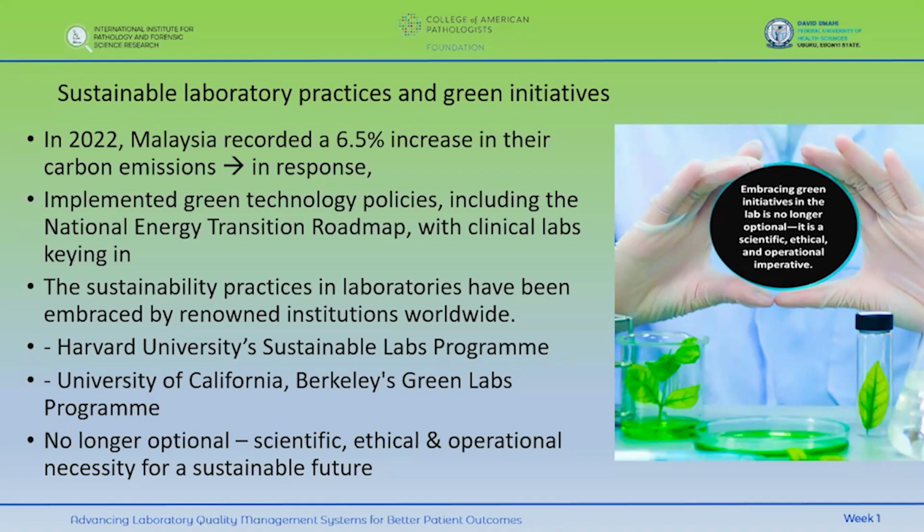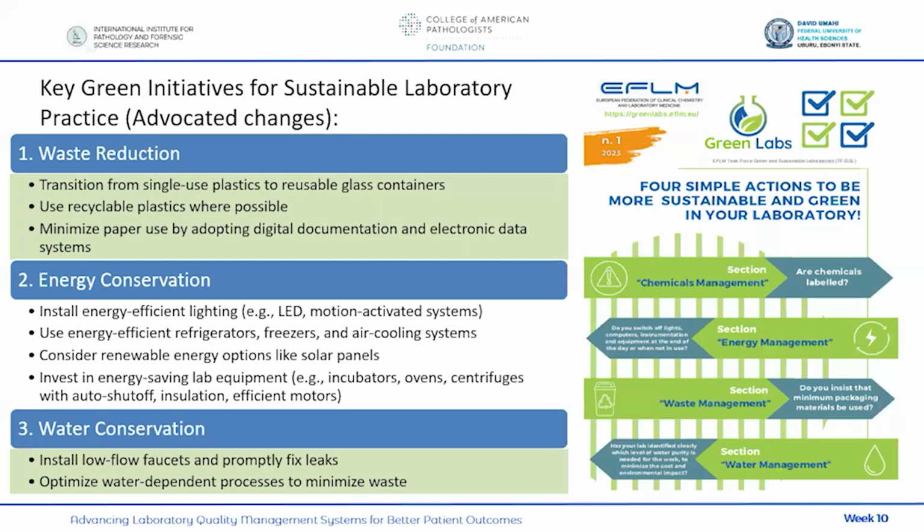Not only that, worldwide renowned institutions have already keyed in. They have Harvard University's Sustainable Labs Program and the University of California Green Labs Program. People have keyed in. So as it stands now, embracing green initiatives is no longer optional. Rather, it is a scientific, ethical and operational necessity for a sustainable future. So, what are the advocated changes for us now in the laboratory that we should key into?